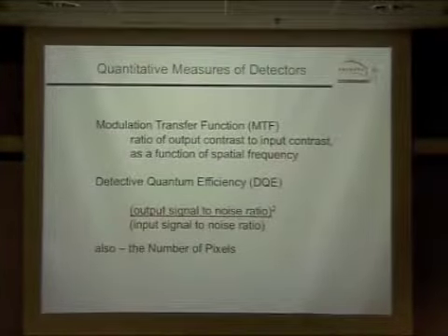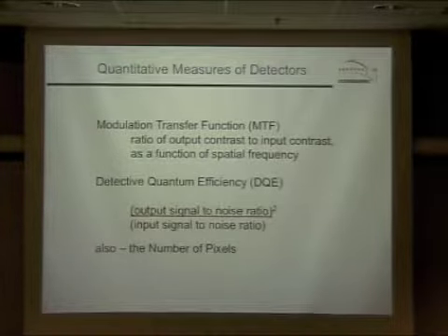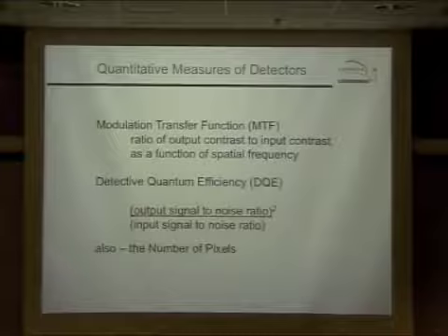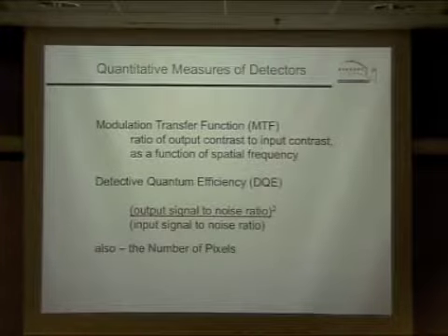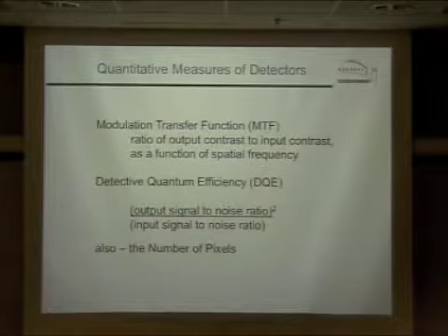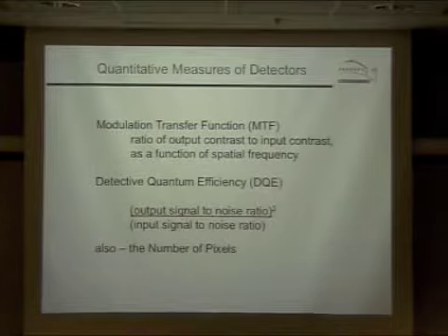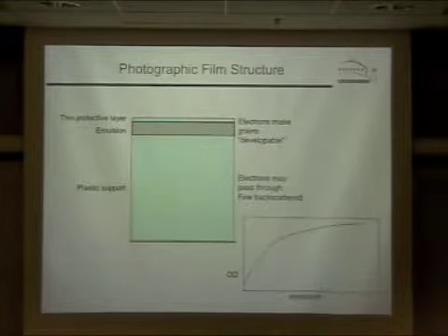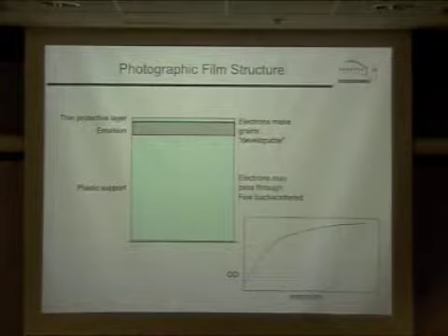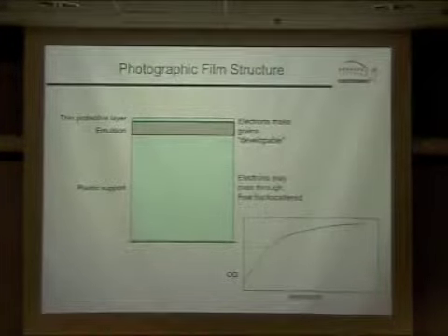the exposure. Of course, the number of pixels is a critical factor in determining the value or figure of merit or desirability of any sort of image recording system, and perhaps more in the context of crystallography than in other applications. But I just wanted to review the structure of these things, photographic film and the CCD.